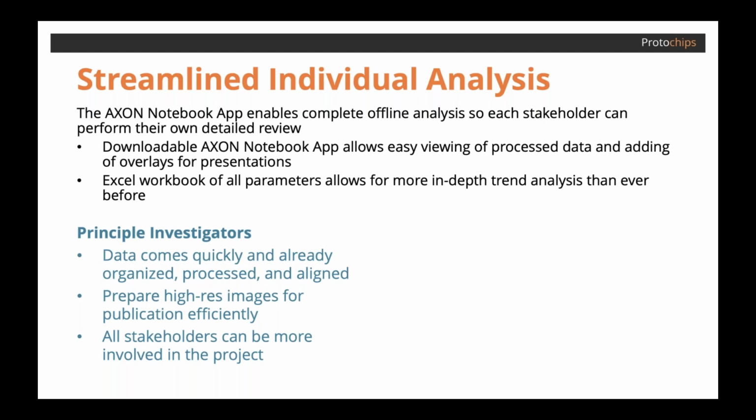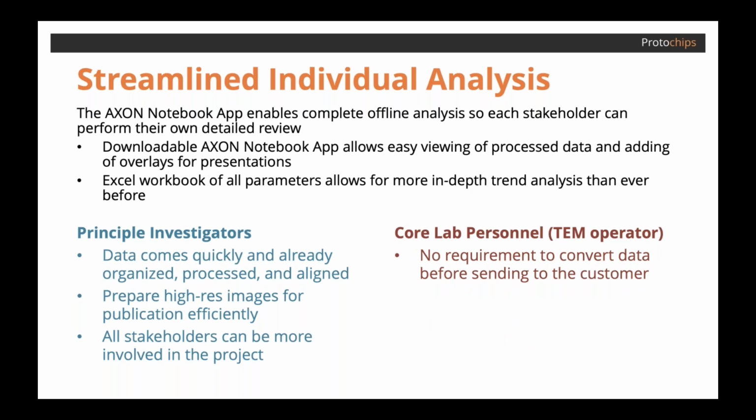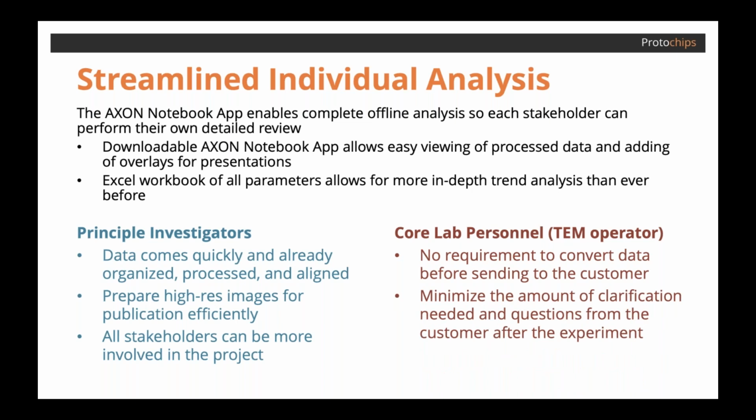And the AXON Notebook app is free to anybody that wants to work and collaborate together. So they can take the same data package and get the same amount of information. And so everybody can be more involved. From the core lab personnel side, there's no requirement for them to convert the data into a format that may be more compatible for their particular customer. And of course, with all that information that's being sent, they're minimizing the back and forth that may occur afterwards with questions about different parameters, and so the customer is fully informed, and you reduce that back and forth.